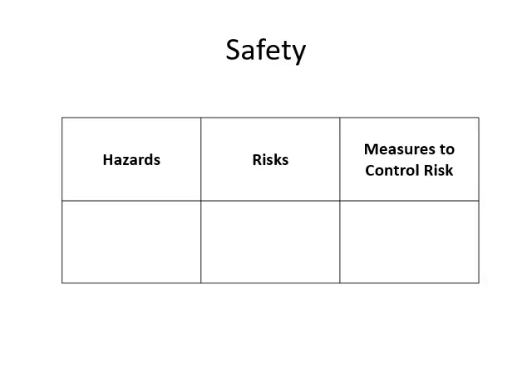Now, we do need to consider safety, and that's a key one of the CPACs. So we have all of the usual safety considerations to make of being in a lab. So many of the points that we know about, such as trip hazards, not running, not eating, not drinking, etc. But specifically for this practical, we are using methylene blue, which you are probably unfamiliar with.